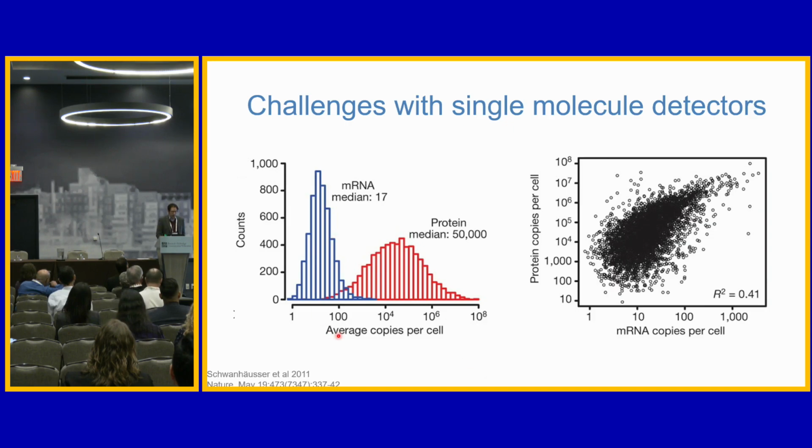So typically what we're seeing here are circumstances where you can make measurements down here using single molecule measurements. But when you start thinking about this from a background perspective, most of the time we're likely to be seeing background in these types of alternative technologies.